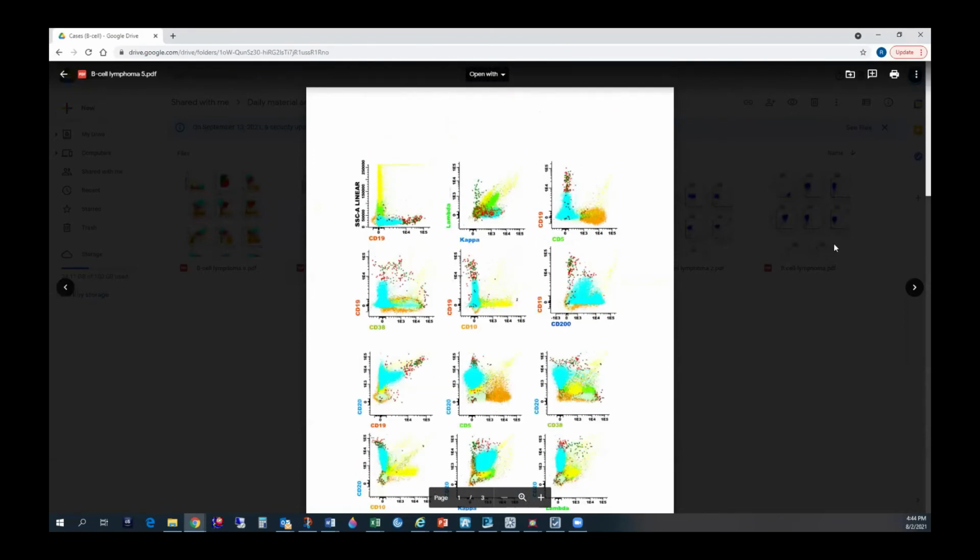Anything else? Is this one from John Hopkins? Yeah, this is from Hopkins, yes. Yeah, I thought so. So here they don't use any lines or anything. And this also has all the cells in it, so we can compare the intensity also with other ones. Yeah, that's how we used to have.